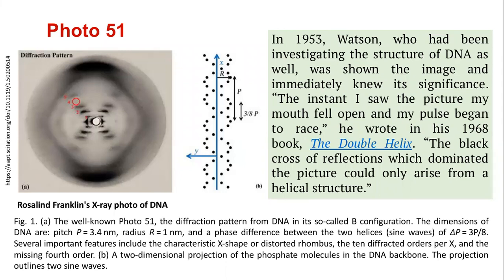And what he wrote was, "The instant I saw the picture, my mouth fell open and my pulse began to race. The black cross of reflections which dominated the picture could only arise from a helical structure." And it is this diffraction pattern that became the solid evidence to prove that DNA is a double helical structure, and it is with this evidence that Watson and Crick proved that DNA is a double helix.